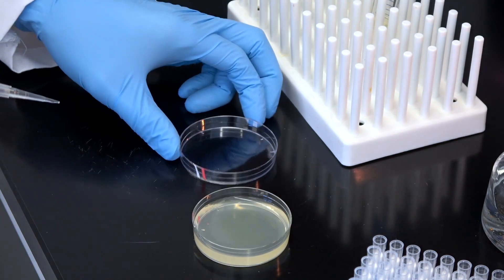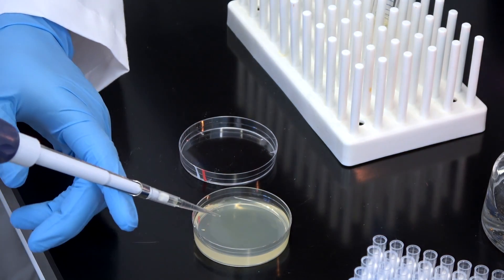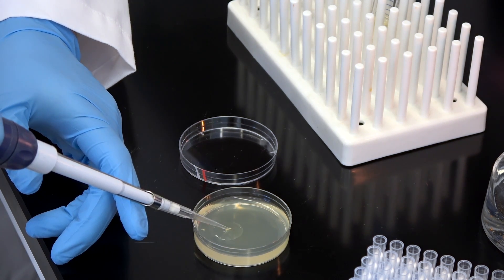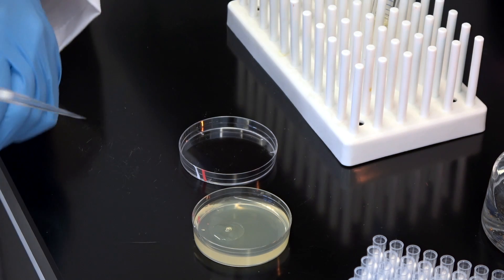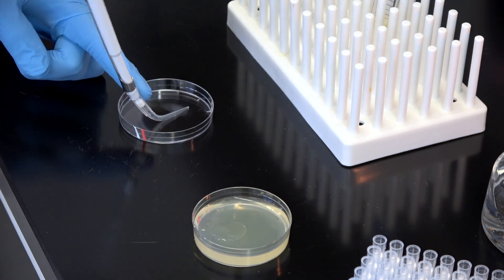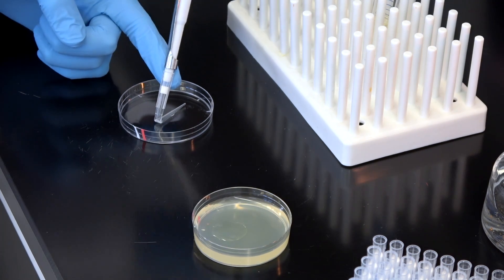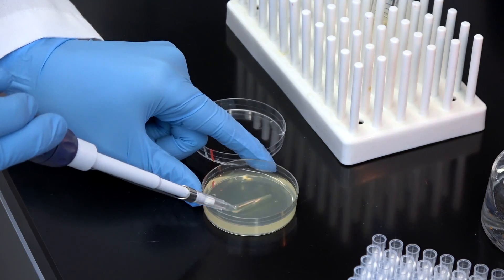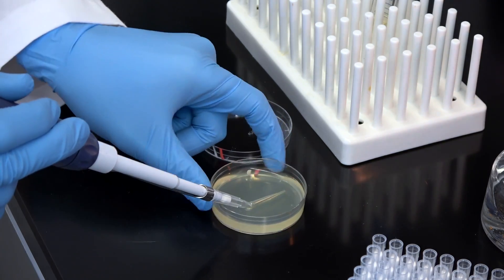When you need a fast and easy way to spread transformed cells or antibiotic over an agar surface, you could make use of a pipette tip to get the job done. You'll just need to bend it first. Using your finger, simply bend the pipette tip into an L shape on a sterile surface such as the inside of a petri dish lid. Just like that, you're ready to use it to spread reagents over agar.